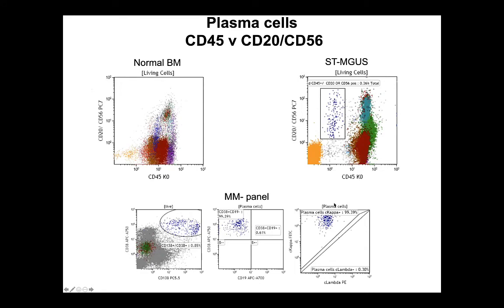Although the myeloid lymphoid screening tube is not capable of gating plasma cells because CD38 is not incorporated in the tube, we complemented the analysis template with a pattern recognition dot plot of CD45 versus CD20 and CD56 out of living cells. This is an example of a normal bone marrow sample, and the upper left rectangle should be completely empty of any events. On the right is a bone marrow sample with MGUS, and we can see an aberrant plasma cell population around 0.4% of total that have down-regulated CD45 and acquired either CD20 or CD56. By reflexing to the multiple myeloma panel — shown in the dot plots at the bottom of the slide — it was confirmed that they are CD19 negative, CD56 positive, and cytoplasmic kappa light chain restricted.